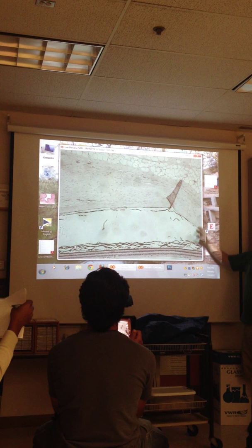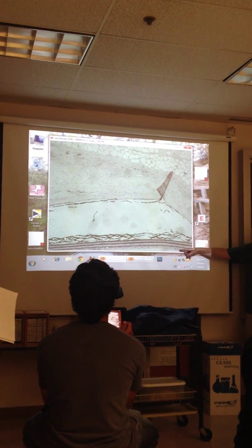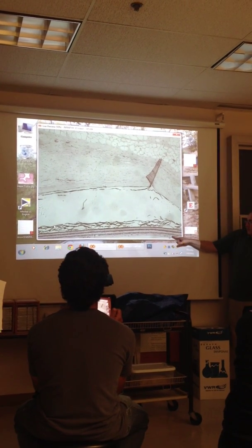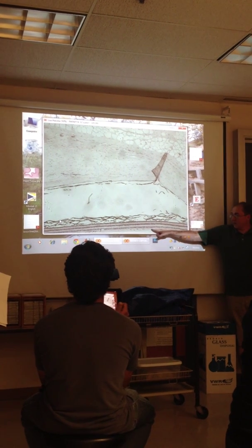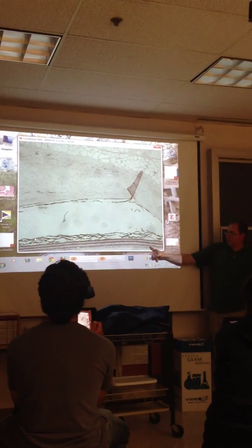That's sclera back there. And you see the retina here, and you see all three cell layers pretty well defined. And we'll zoom in. But those cell layers, going from the posterior cavity, which would be down here, where the vitreous humor and aqueous humor and all that stuff is, you can see these nuclei that are spread out and look really big. Those are going to be the ganglion. So that's the first layer of cells you run into, moving through the retina here.